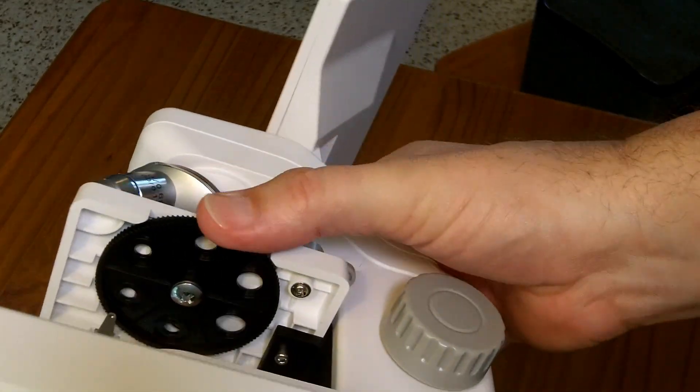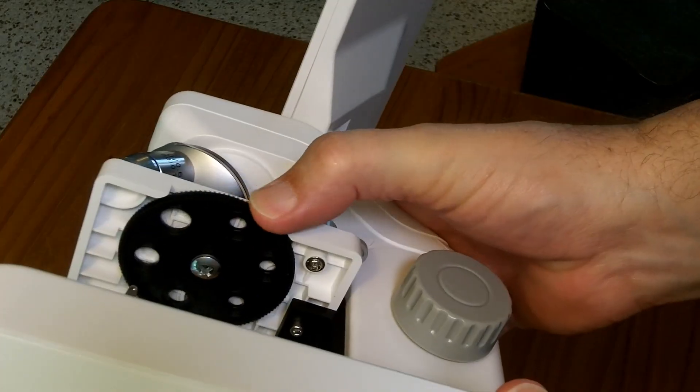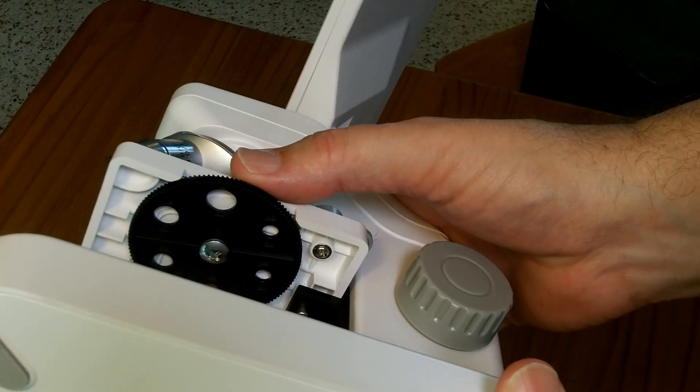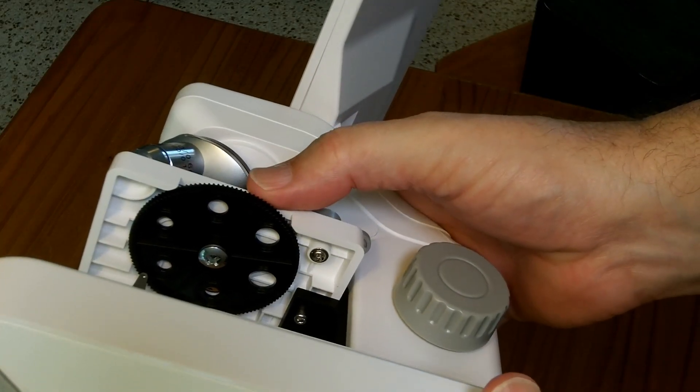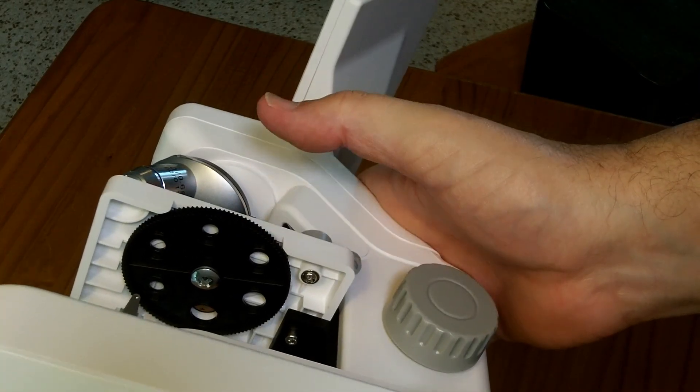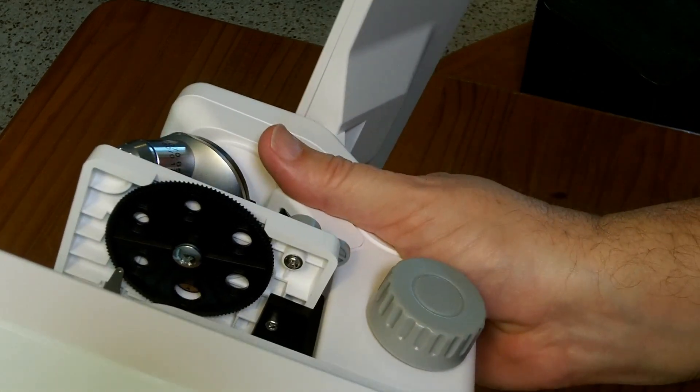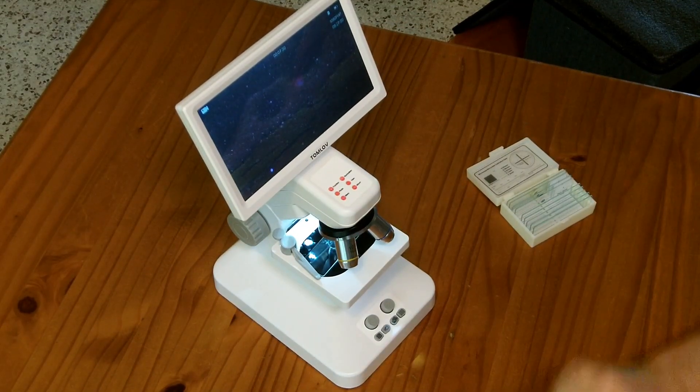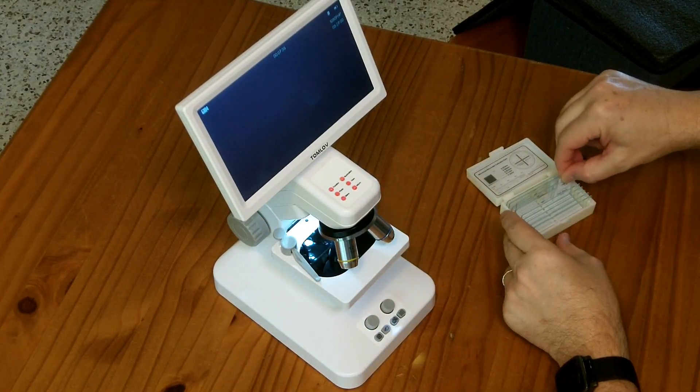So this wheel on the bottom just has different sized holes. It seems like the type of thing where it should have colored filters, but it might just be to basically direct the light and say, are we having a whole bunch of light or a very directed beam of light? It didn't appear to really change the brightness of the light because the gain on the camera has such a wide range. It really just auto-adjusted to whatever was in here. So I guess unless you know what you're doing with this thing, I'd say just leave it on the largest one. So this guy works, does a pretty good job with a prepared sample. I want to go and get a drop of lake water and see if we can see anything alive swimming around in it.